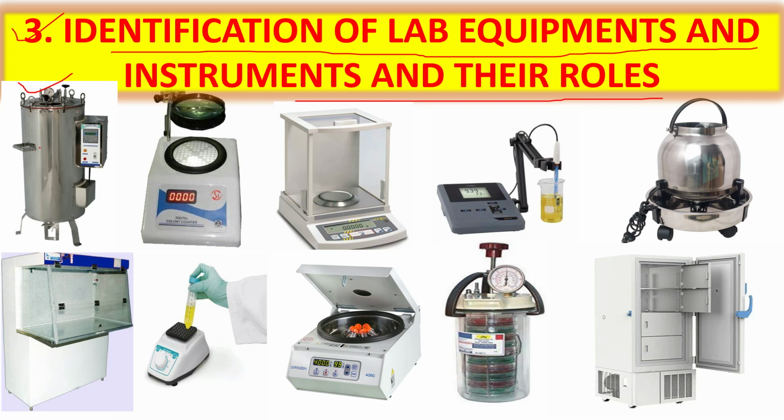So you have to know the principle of this autoclave. That is, it is run at 121 degrees Celsius for 15 minutes at 15 lbs pressure. Okay, and the precautions you have to take before and after starting the autoclave, all we have to know. So next thing is the colony counter.